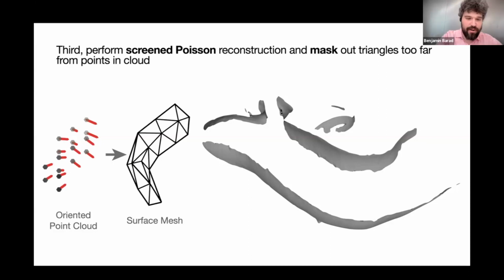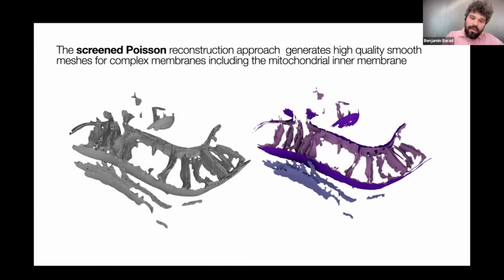So this is a mitochondrial outer membrane. It's really long and sort of simple. You can just sort of do it. But it also works for arbitrarily complex membranes. And so for the first time, we're really able to go from semi-automated segmentation all the way through to these meshes, where we have geometry encoded in a single fully automated step. And these are scripts that you can download and run. This step takes about 1.5 minutes per tomogram typically.